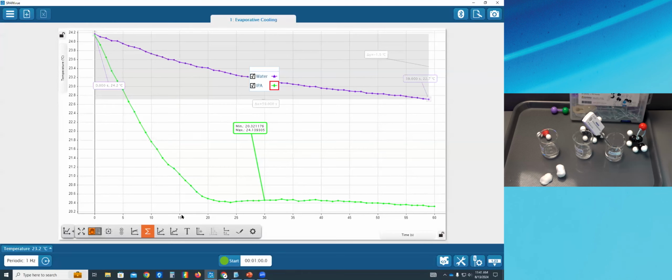If I want just minimum and maximum for part of the run, I can switch from this hand move select mode. If I click that button, it switches to that rectangle. And if I draw a selection, it will give me the minimum and maximum. Whoops, I accidentally put that in the wrong place. For just whatever data is highlighted in yellow. There it is. Did you see how the numbers are different?